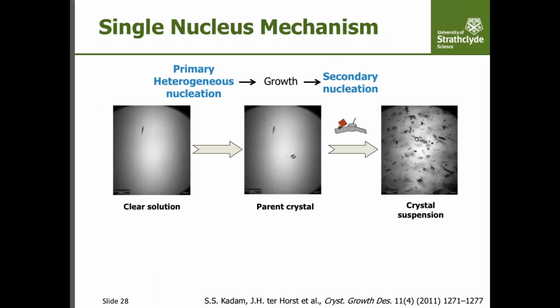And we also observed this in some experiments in the Crystalline. If we are lucky enough, in the stirred solutions at a constant temperature where we have supersaturation, then we see a large parent crystal floating by the camera before we really detect any induction times with this sample.